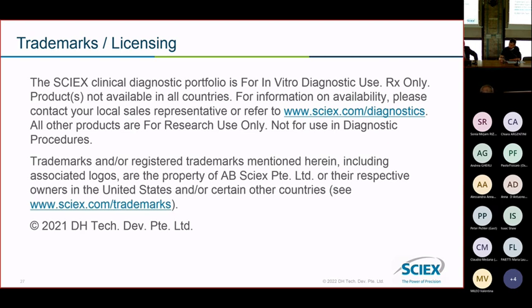No, for this application, I'm just now opening the field, so you should consider all possibilities. Now, in this case, we're running at 45 minutes. That was the gradient time, not the runtime, when you consider the M class. But if you consider the EvoSep, it is a different cycle time.